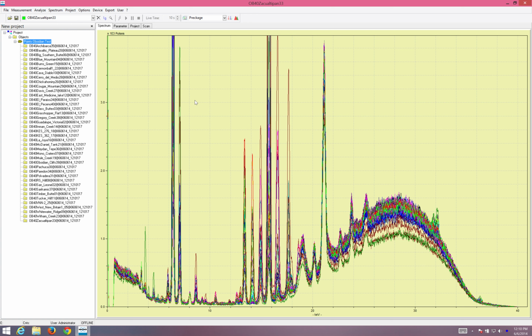You can hold up to about 100 spectrum at a time in this navigation window for the spectrum. In this file system, you can have thousands and thousands of different spectra, and it'll actually read in the spectra and regenerate them in this program. So you're not affecting the original spectra files. They'll be in the folder just where I left them. But by adding them to this window, it essentially duplicates and copies those spectra to this file.